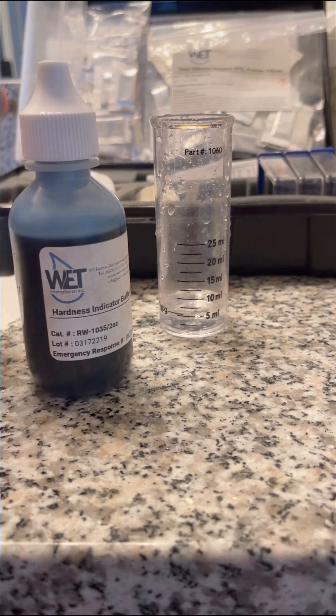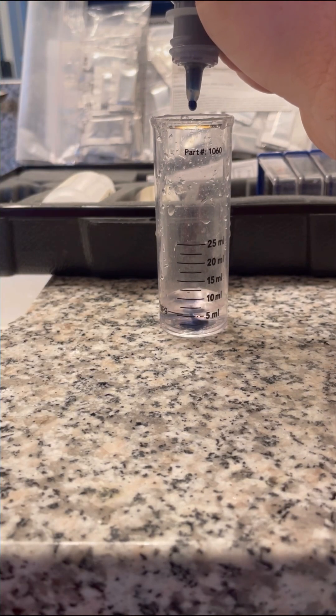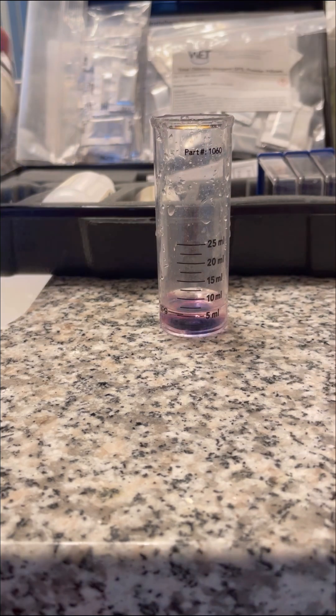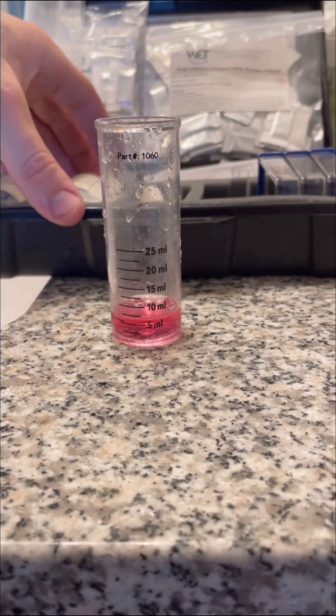My preferred method is titration. For this method we first take a sample of the water and then add seven drops of this first solution. If the water was already soft, meaning that the calcium and magnesium were not present in the water, this sample would be blue.